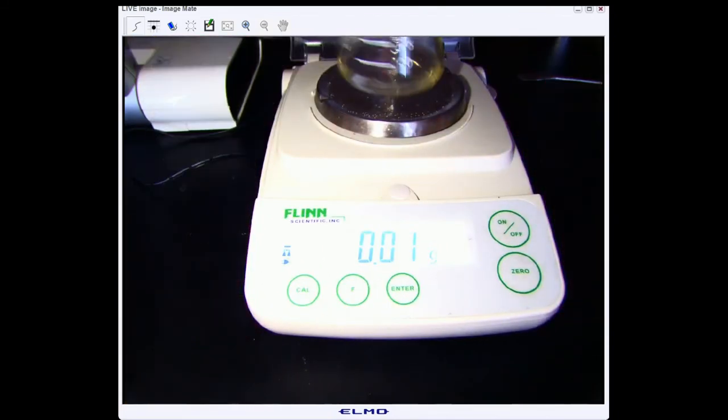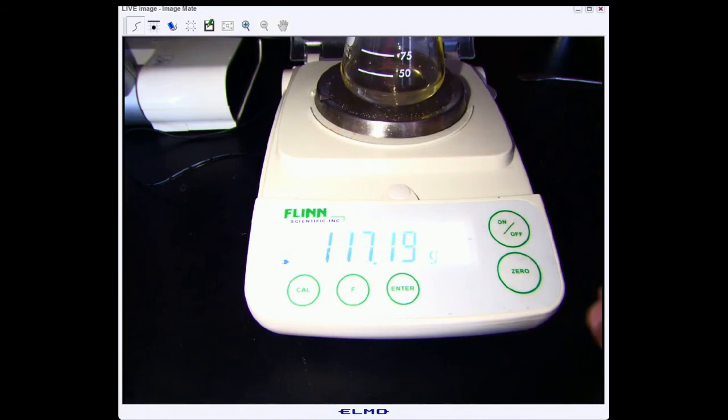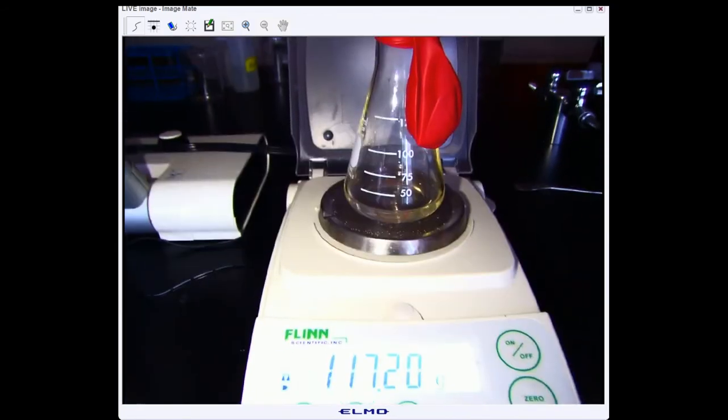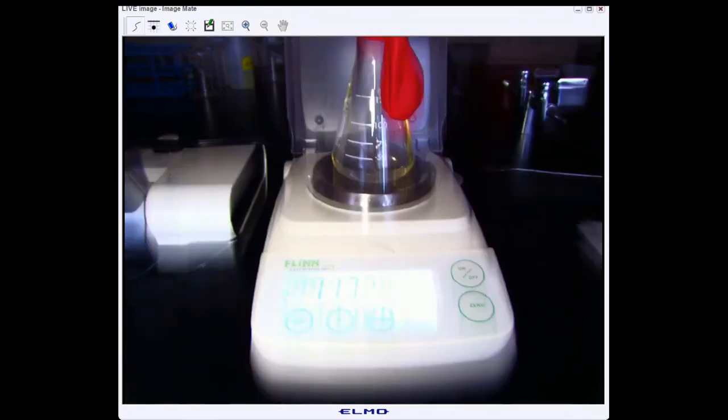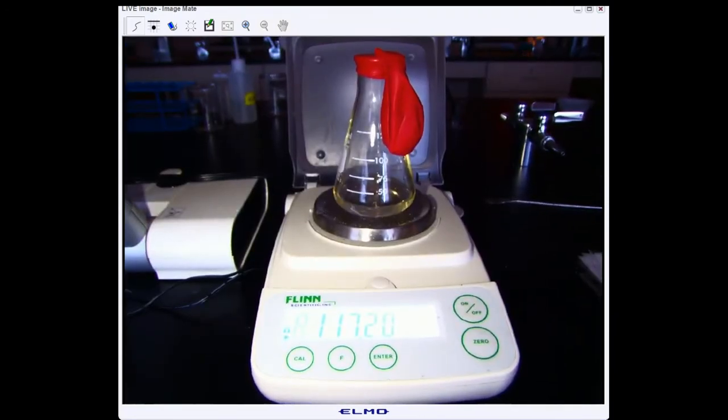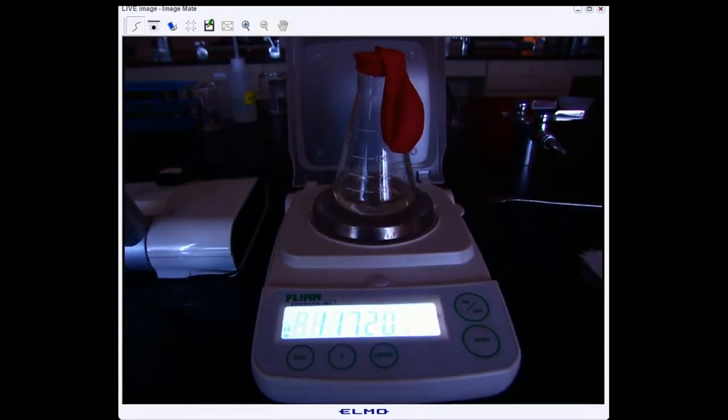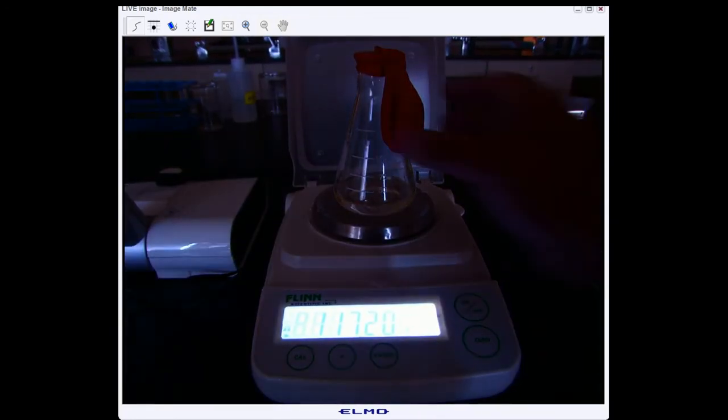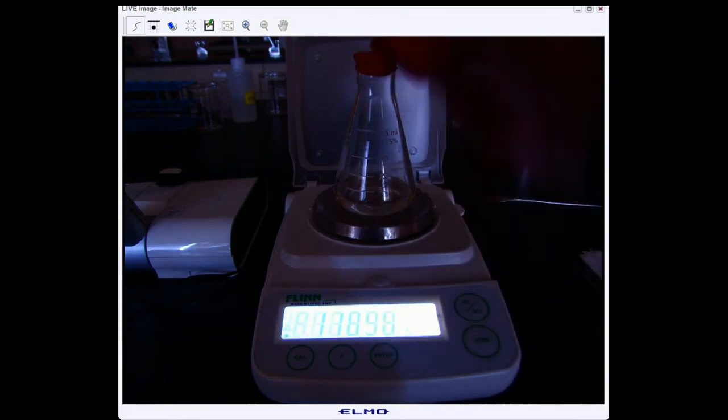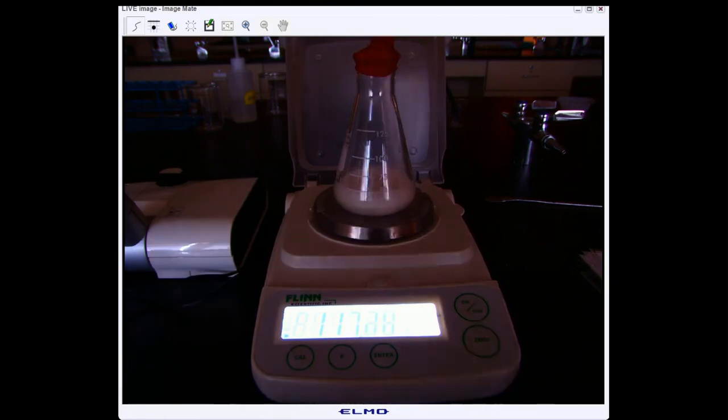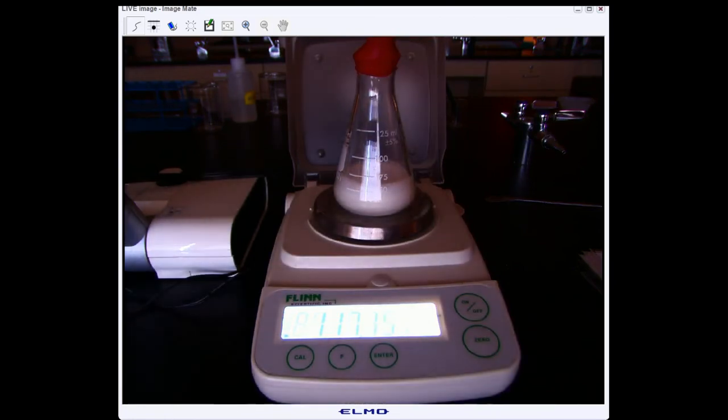So we're going to pick it up, place it on there. And we're going to pick up the balloon so that we can get the reaction to happen, and then we'll record the mass right as it goes. Make sure you're writing down any observations for what you see happening.